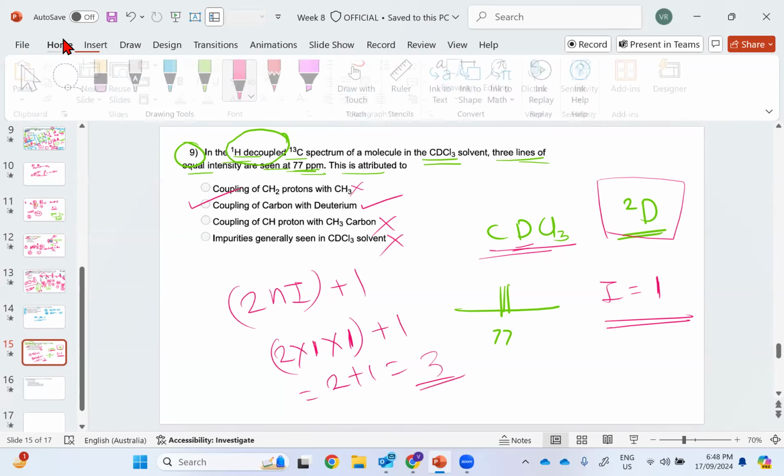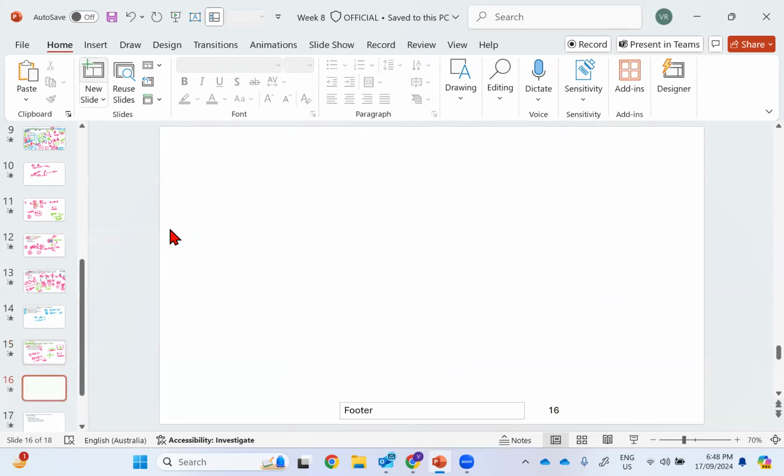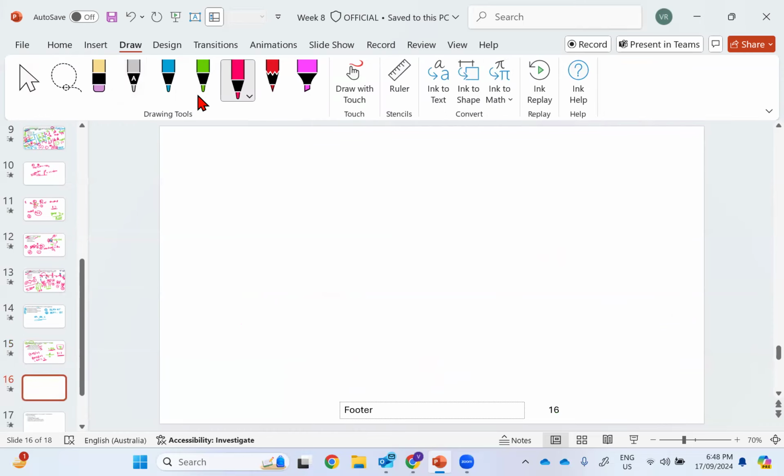Also, when you move to the next, when you see the actual NMR spectra, I will give you some assignment. So in the 1H NMR spectra, where do these peaks come from? Peaks at 1.5.